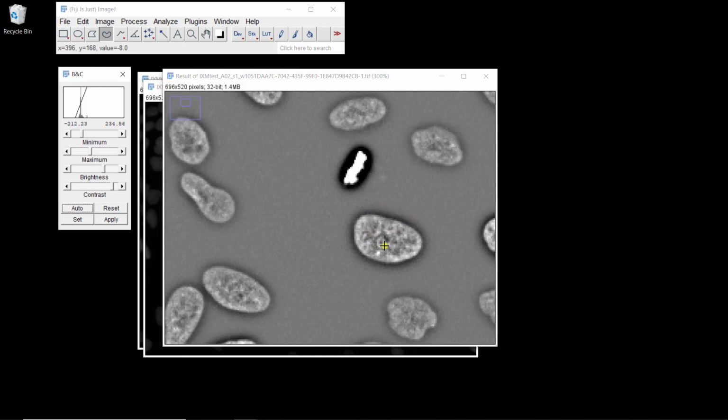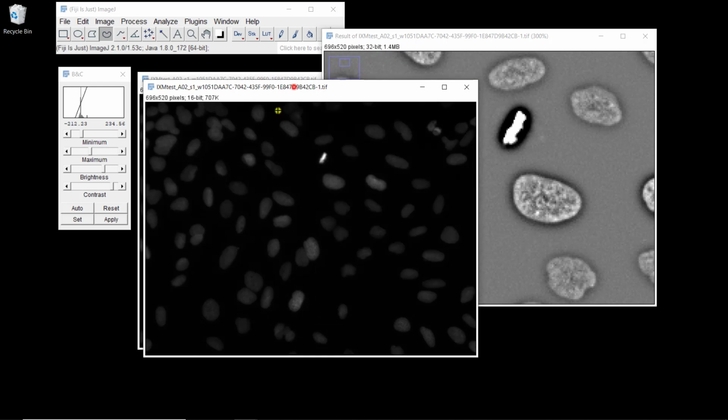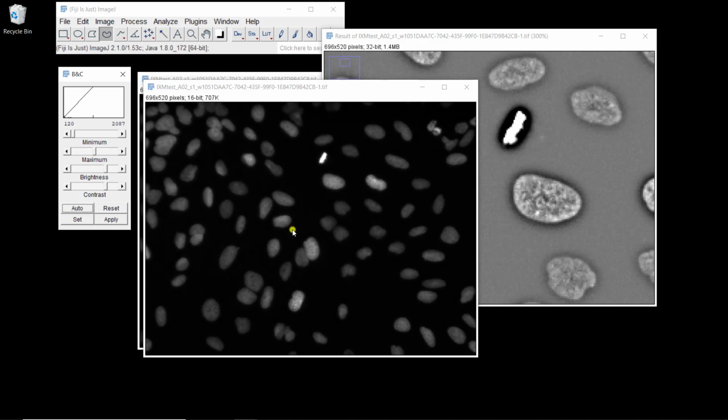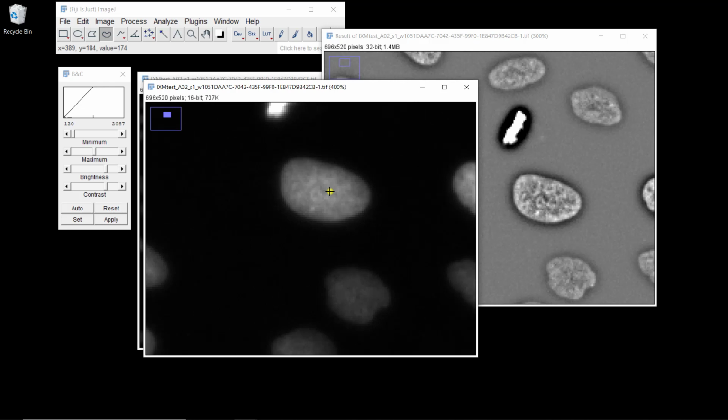Now, inside the nuclei, the intensity is less uniform. So if you blur it and you remove the average, then you're going to have low values in the local maxima. So if I look at the original image, I'm just going to adjust the intensity again, and zoom in on the same region.